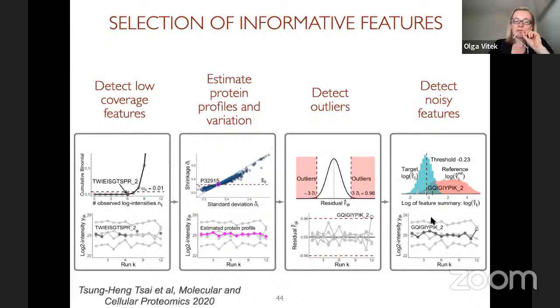With DDA, it works to some extent if we have enough features in the protein. For SRM or targeted experiments with few features, the main benefit really is finding individual peaks which are outliers, or data curation. It complements manual data curation, but I would say it's most useful for DIA.